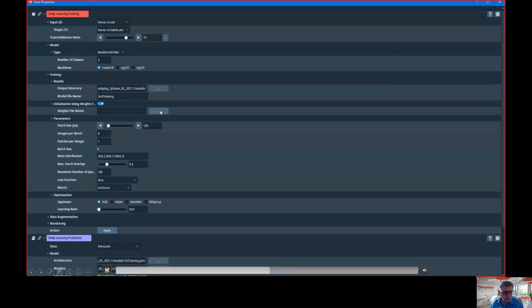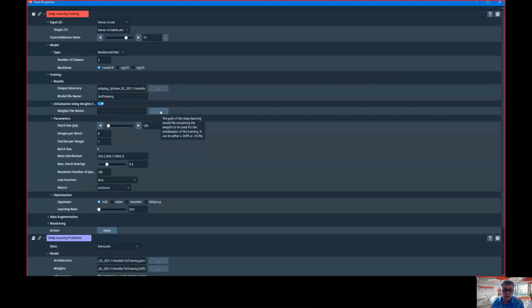So what I'm doing in the video here, I'm doing the second training using the weights that have been computed in the first training. So in a way, I'm not going to start again from scratch. The first training has got some good result. I want to improve it. So I will have to do some more intense computation for a longer number of epochs with a smaller learning rate.